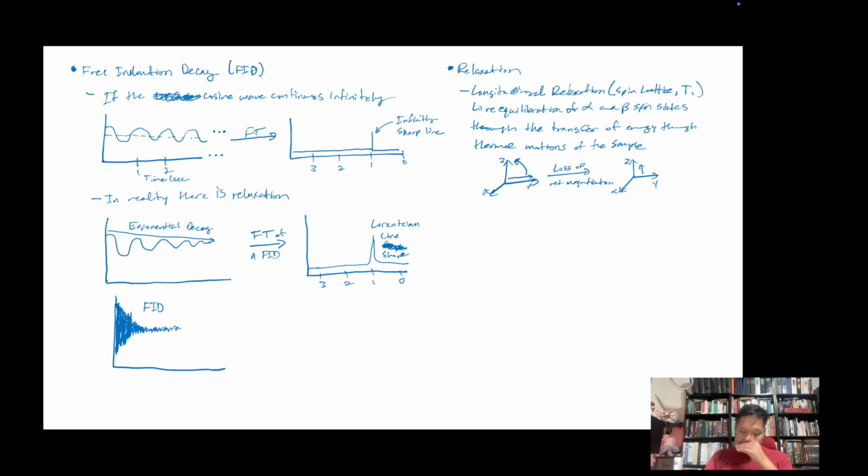All right, cool. And then the last type, which I alluded to a second ago, is known as transverse relaxation. This is also known as spin-spin relaxation, or also known as T2 relaxation. So actually it's probably most commonly known as T2. So T1 and T2 are very common designations for this type of relaxation. NMR instruments use that. So what is this?